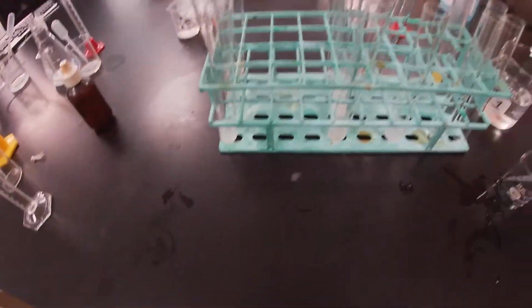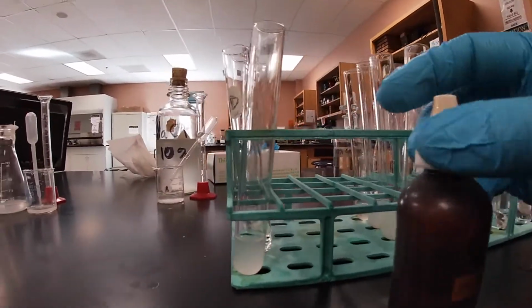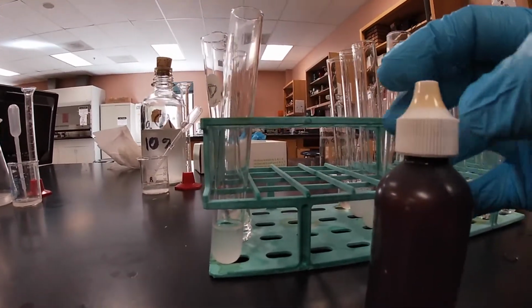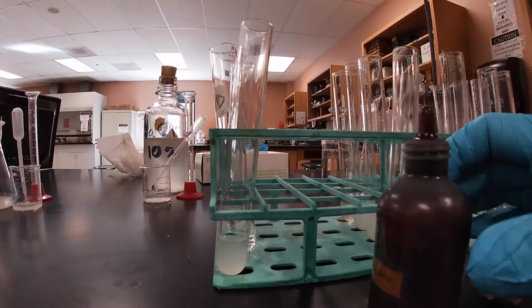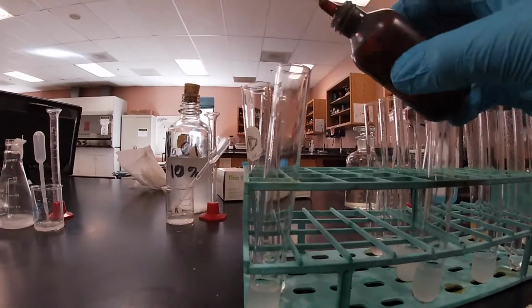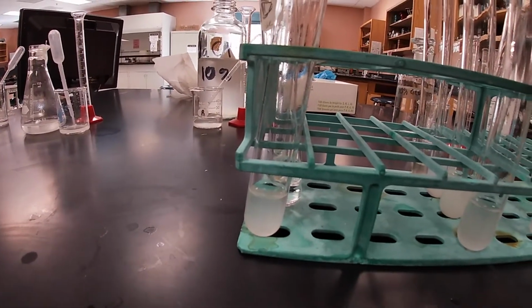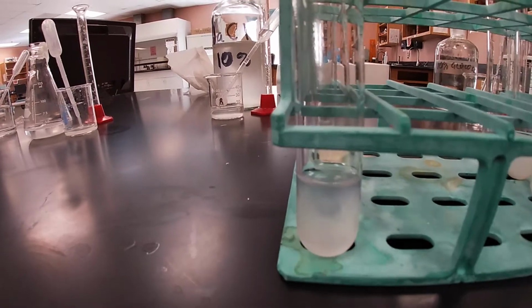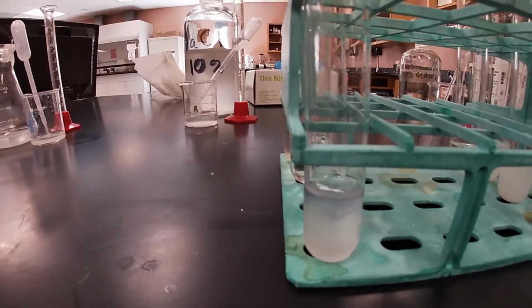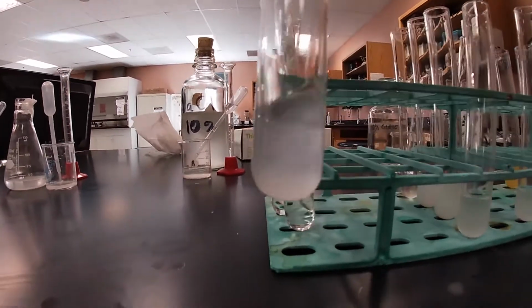And okay, so as you can see here, we're going to get our iodine. We're going to do our iodine test for the inside contents, right after the dialysis tubing has been submerged for about, what is it, 30 minutes? So we're going to add and check it out. And as you can see, this one is turning blue. So definitely starch present inside the contents, nice and blue little color based on our iodine test.